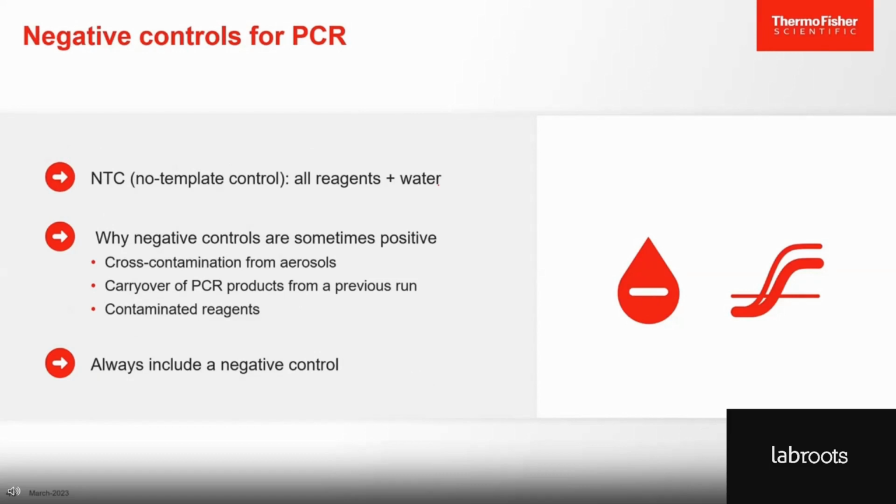Then there are negative controls. Here, every component necessary for PCR is added except for the template. Accordingly, without any template present, there shouldn't be any amplification, of course, so they run to check for unwanted contamination with the template. However, sometimes these negative controls are positive, meaning some DNA template is present in the reaction. So how did it end up in a reaction?